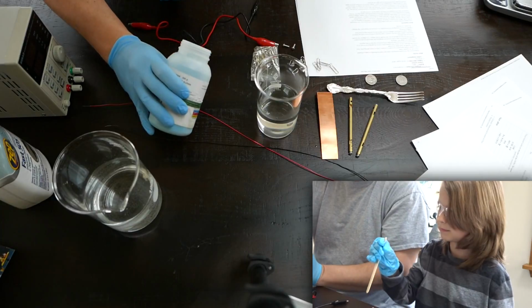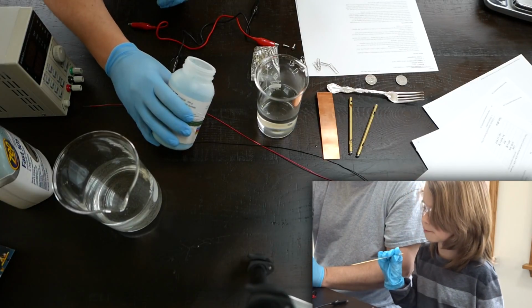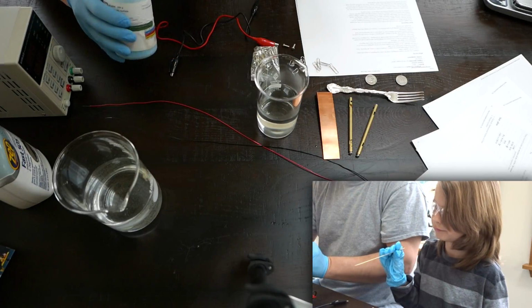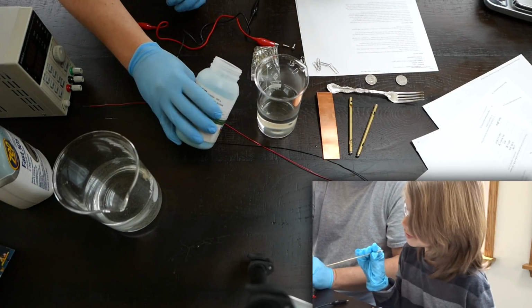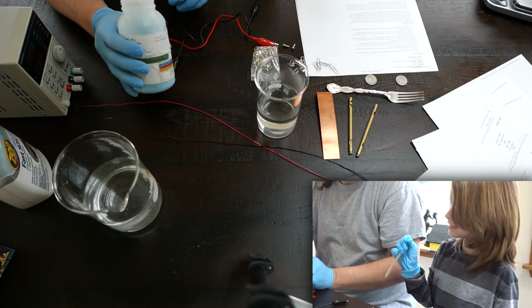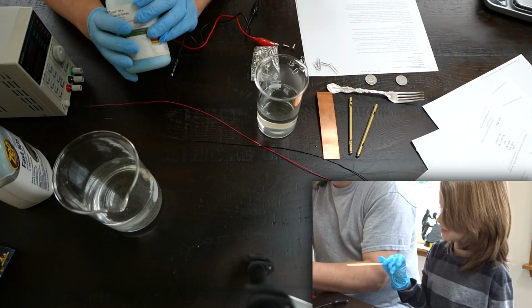Can you describe what it looks like? Oh, I thought it was water. No. What does it look like? Crystals. Okay. What color are they? Cyan, I guess. I was expecting blue, but cyan is probably more accurate.